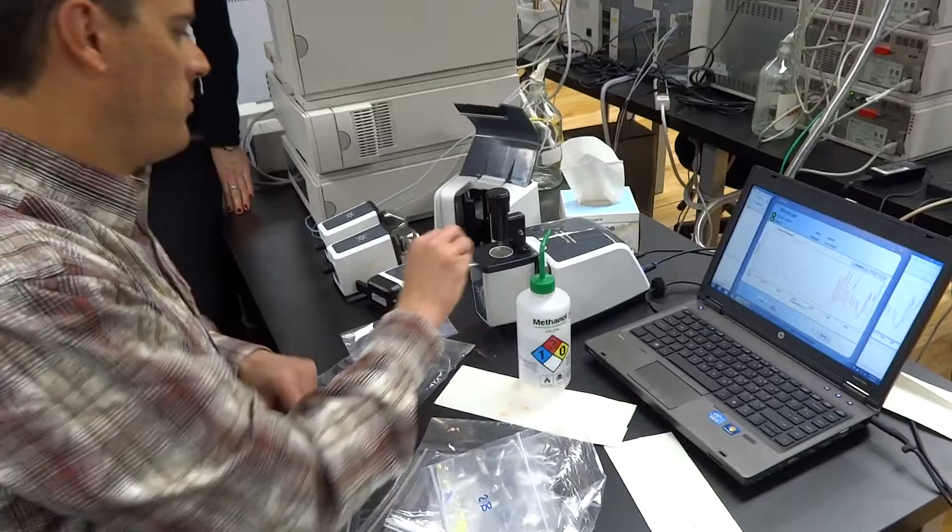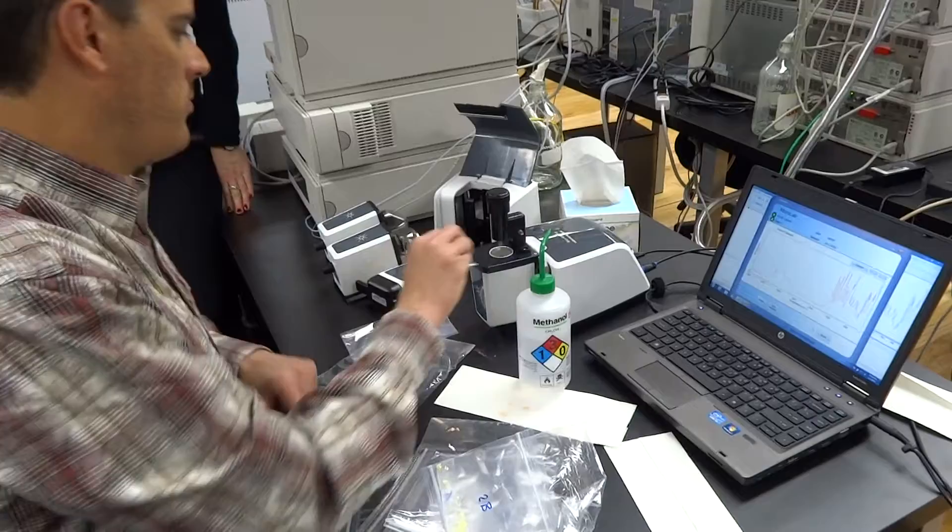So only it looks at that diamond. What it does is it hits with energy and there's a little bit... Small amount of energy transferred through the sample. Very small. So that's why we want to have very nice contact.